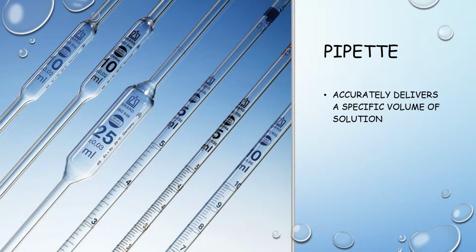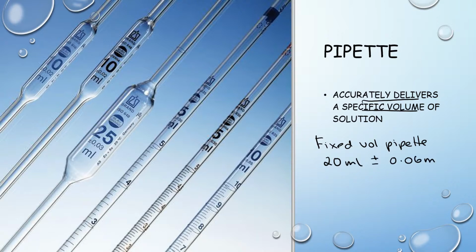A pipette is designed to accurately deliver a specific volume. We'll be using fixed volume pipettes, which are like those shown. And the one that we'll mostly use is the 20 ml one, which has a very small error of plus or minus 0.06 mil. You can also have variable volume pipettes, which you can adjust to deliver different set volumes, but we won't be using them in our laboratory.